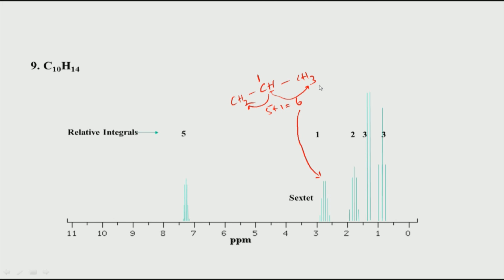And then if you look at the methyls, there are 2 methyl groups here. Again remember, methyls typically come between 0 to 2 ppm, and there is no oxygen here, so there is no electronegative atom. That is why you do not see any peak at 4 to 5 ppm. So these are all purely aliphatic spin systems, aliphatic protons, and here you can see there is a triplet, that is a methyl, which means it is attached to a CH2.